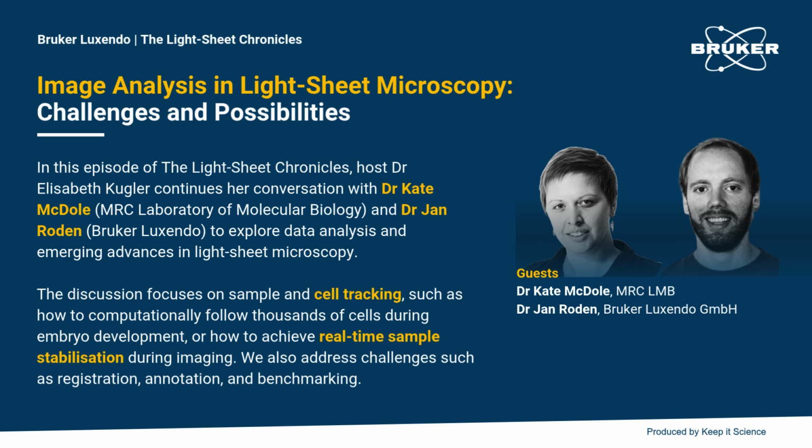I mean, the beads-based registration methods are very different. They use very different algorithms, and it's much easier, but unfortunately, in practice it's not really so easy to put beads into your sample. So that's why we are trying without. Yeah, I can agree. I've tried several kinds of bead-based registrations and it was never quite successful.